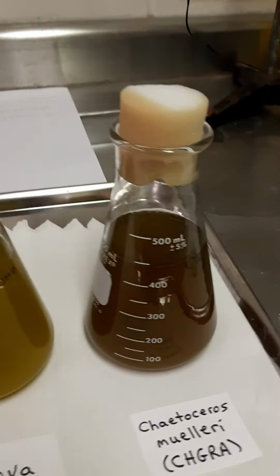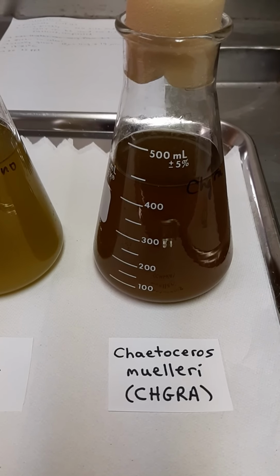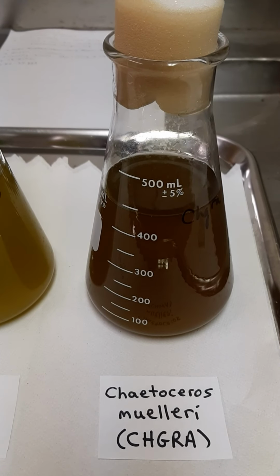So the last species that I want to tell you about is the Chaetoceros muelleri. It's also called a Chaeto. This is a diatom, actually. It's different from the rest. It's not motile.